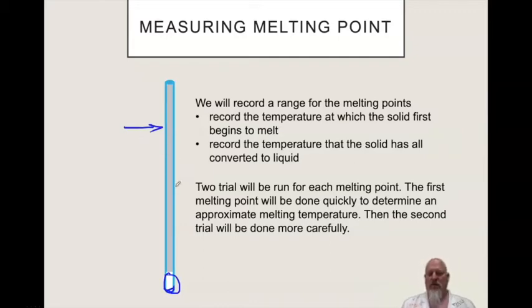Okay, we're going to watch our solid. When it first starts to melt, when you first see the crystals starting to move around a little bit, you're going to record the temperature. And then you're going to keep watching. And what you're going to see is it's going to melt, and then all of the solid will have converted to liquid.